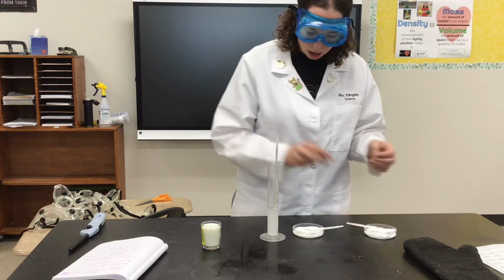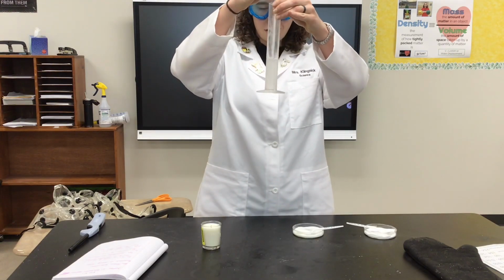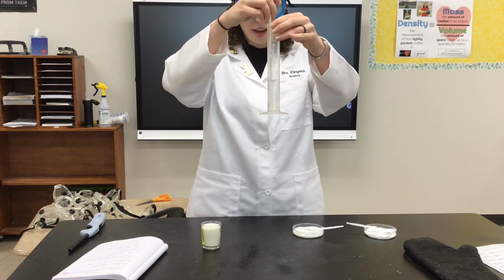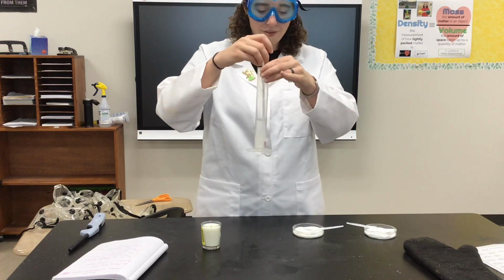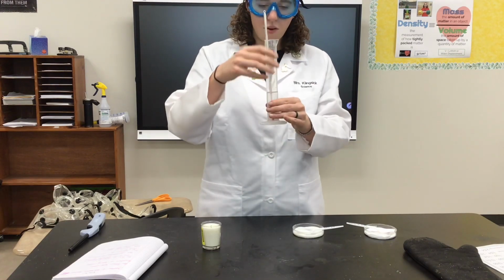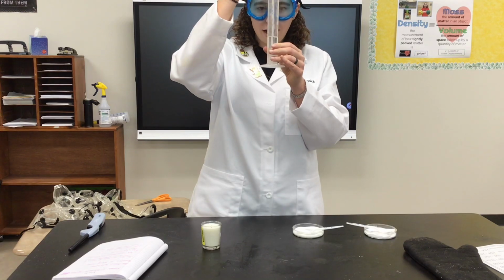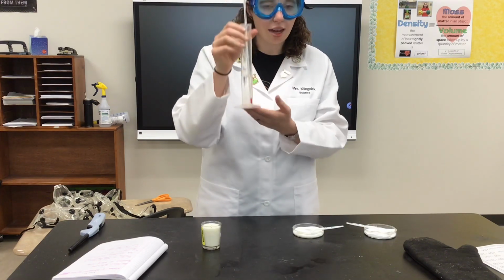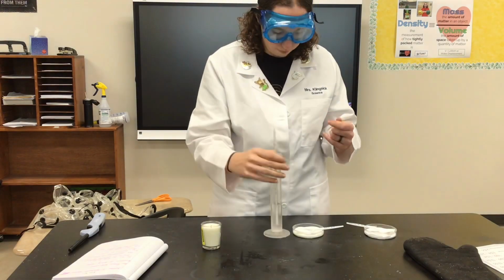Okay, I'm going to stir it. Now, if you notice, there are no bubbles being created. All that's happening is that the sodium bicarbonate is being dissolved into the water. So right now I have not seen a chemical change. Okay, so I'm going to use my thermometer to tell what the temperature is. So it looks like it's about 17 degrees Celsius. And when I touch it, it feels cool, but it's not cold or anything.